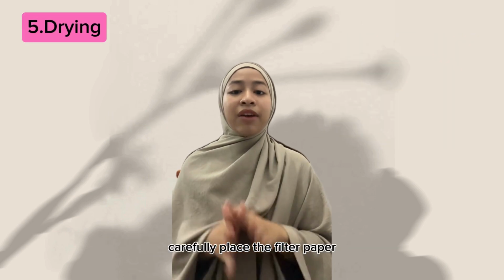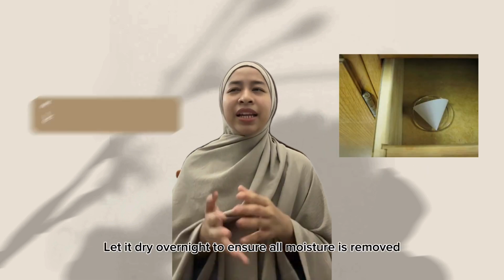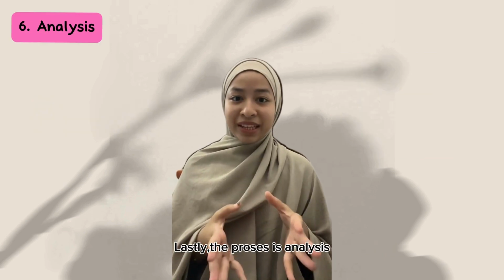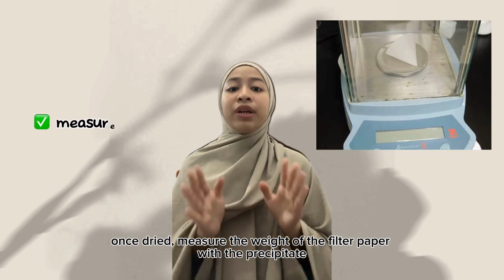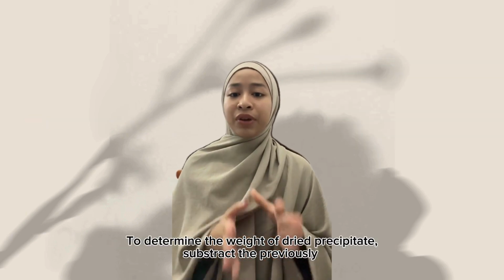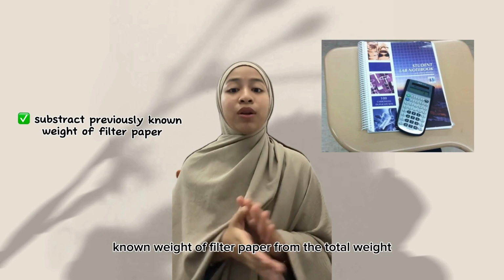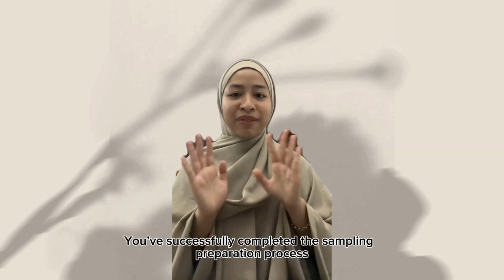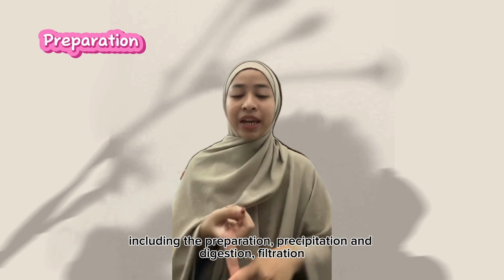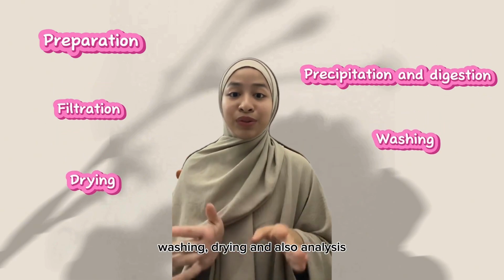Next is drying. Carefully place the filter paper containing the precipitate onto a petri dish. Let it dry overnight to ensure all moisture is removed. Lastly, the process is analysis. Once dried, measure the weight of the filter paper with the precipitate. To determine the weight of the dried precipitate, subtract the previously known weight of the filter paper from the total weight. And there you have it. You have successfully completed the sampling preparation process, including preparation, precipitation and digestion, filtration, washing, drying, and also analysis.